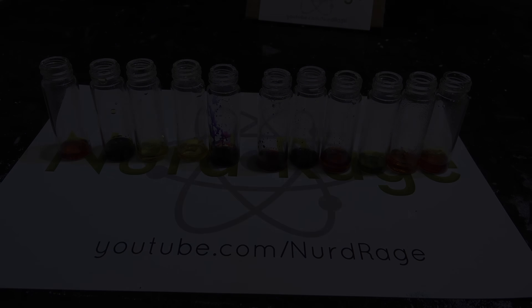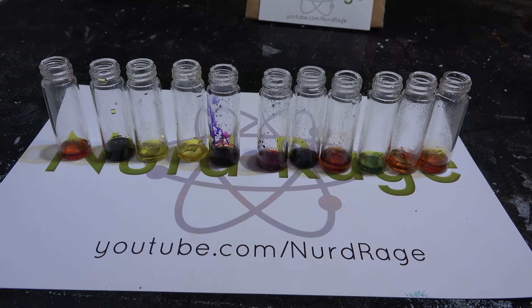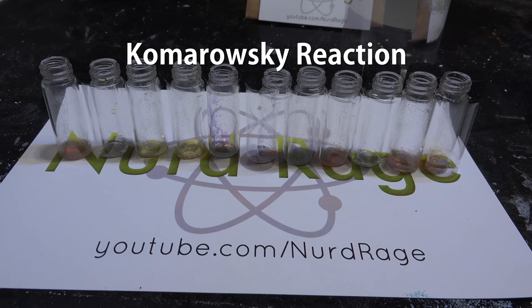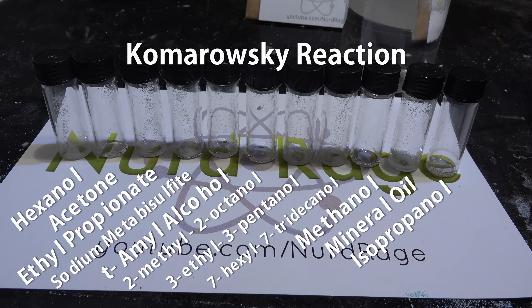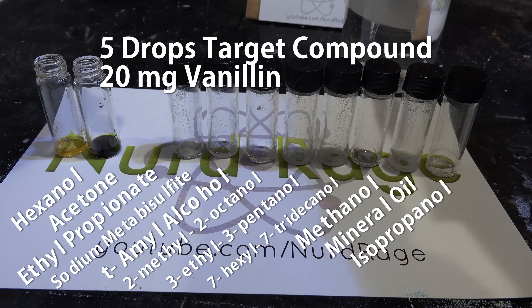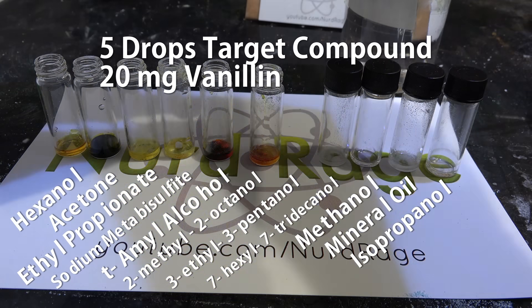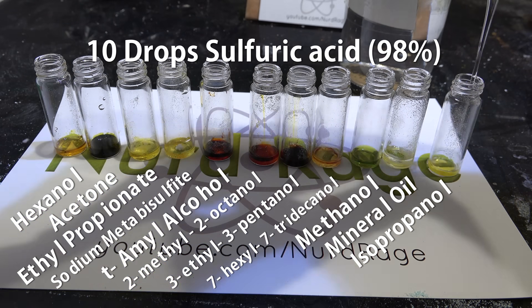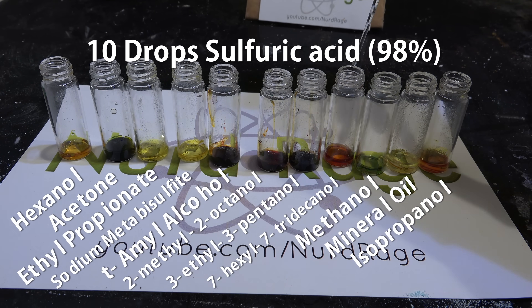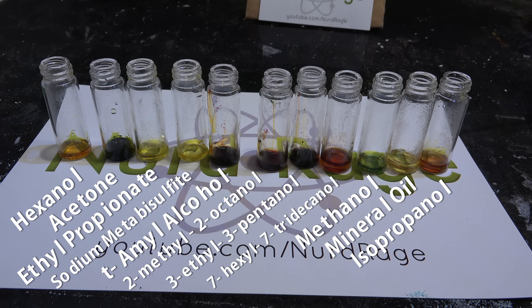Dichromate testing alone is simple, so I want to try another reaction — a very simple one I found called the Komorowski reaction. I have the same panel of reagents containing 5 drops each, and I'm also adding about 20mg of vanillin. We then add about 10 drops of concentrated sulfuric acid and let it sit. The benzaldehyde of the vanillin reacts with these samples to produce strongly colored organic products.